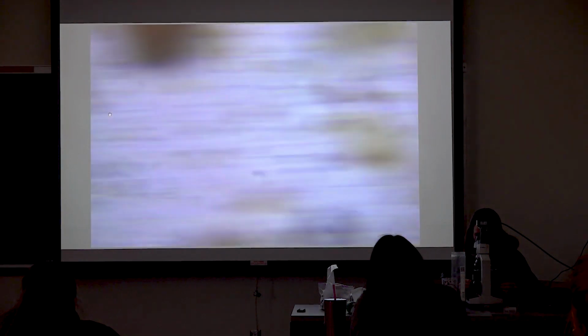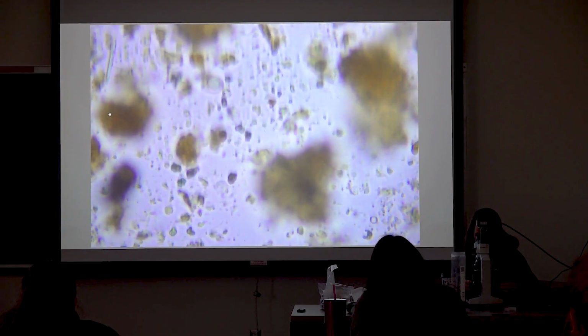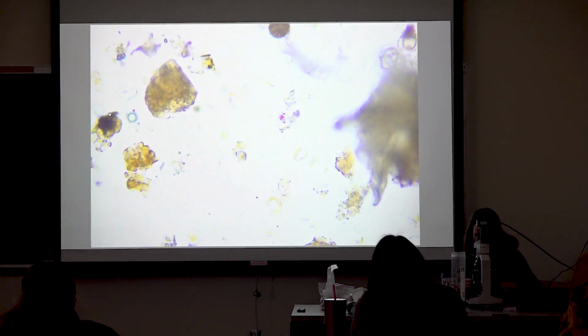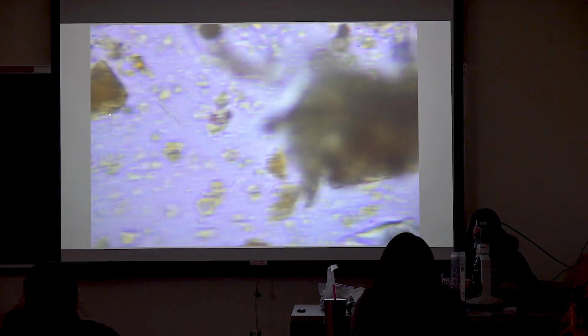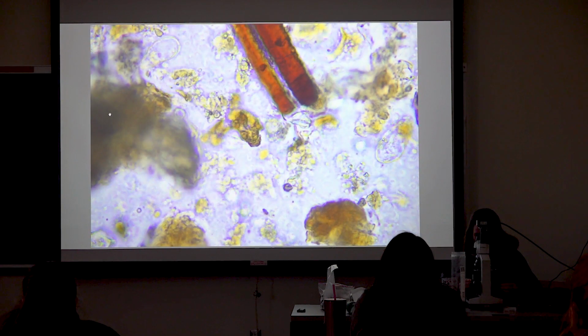So typically for nematodes, we do a quick scan at a much lower power because nematodes are quite large and you can spot them pretty easily. I was going to see if I could find some. Boatloads of amoebas though, so good job, whoever's compost this is. Is that red one contamination? There is a red colored piece. Oh, that? No, probably just some kind of organic matter.